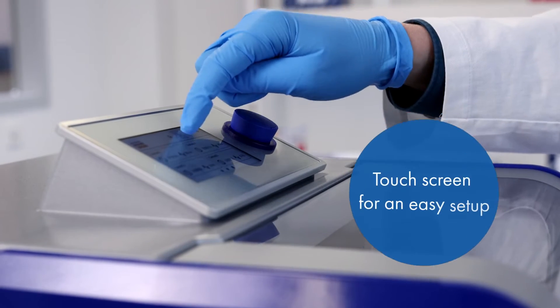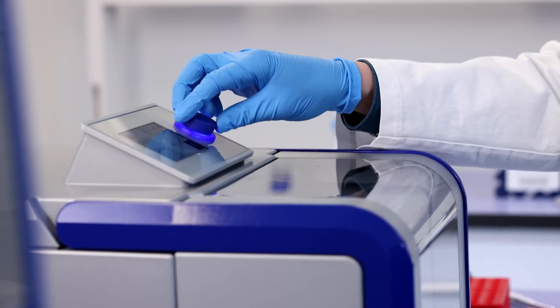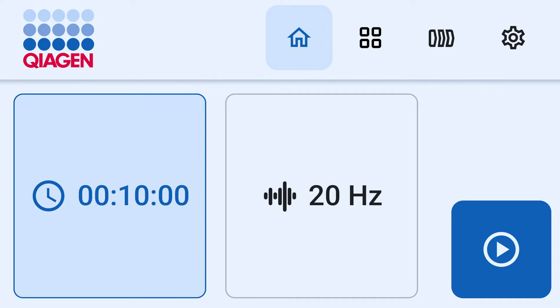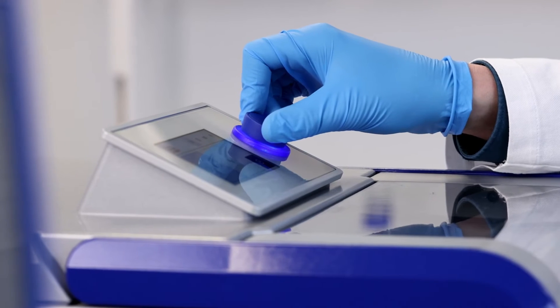Let's look at the touchscreen interface of the instrument. From the home screen you can start the sample disruption run directly. Press the buttons for time and frequency and adjust to the setting required for your sample using the rotary knob.